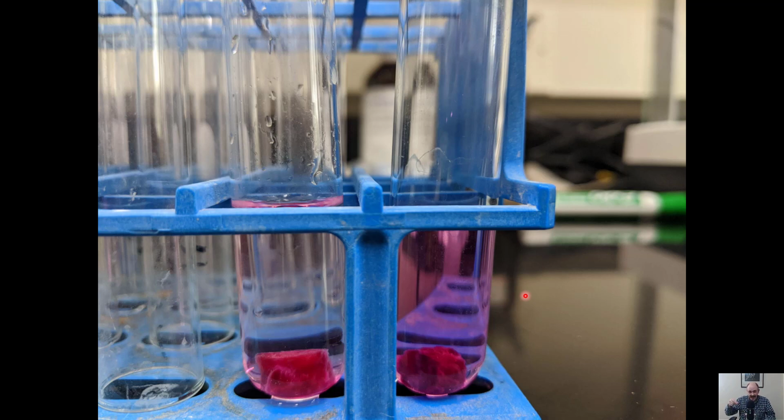Your instructor may tell you to agitate them every once in a while, give it a little swirl to help increase the contact of the beet with ethanol. And then you'll pipette out that ethanol and beet juice basically, and you'll put it into a cuvette, which is the little container that goes into the spectrophotometer. You'll record the absorbance at 535, and then you'll go on and test your other samples. Okay, so that's basically what you're doing this week.